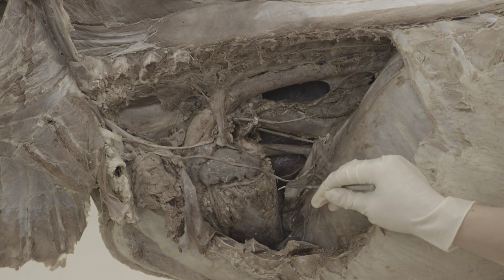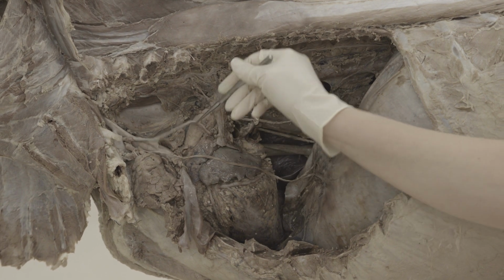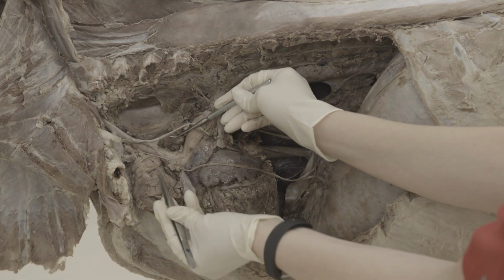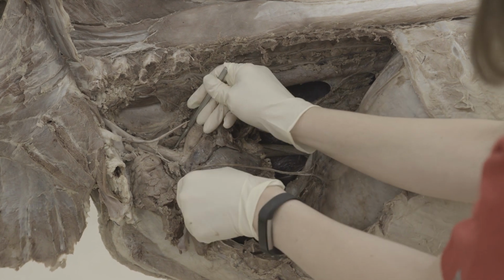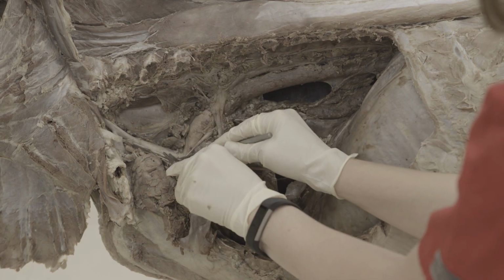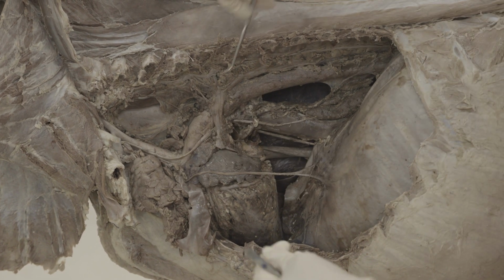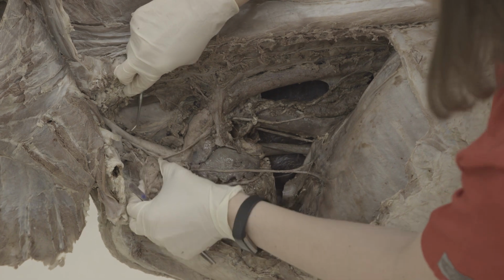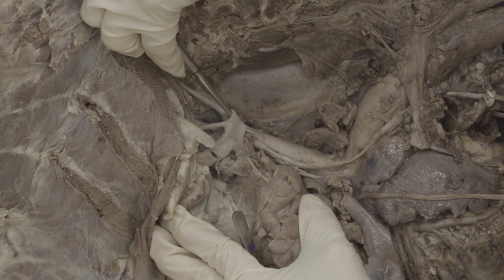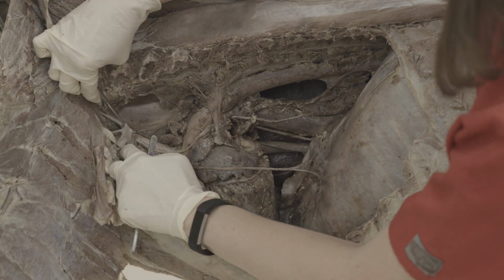All right, so then we'll go back to the aorta. And so we have the aortic arch here, and we have the brachiocephalic trunk coming off of that aortic arch. So again, you have to work through this thymus tissue. So thymic tissue is kind of everywhere in the calf. But here we have the brachiocephalic trunk, and that will continue cranially and give off a left subclavian artery and a right subclavian artery. So here you can see a left subclavian artery coming off of that brachiocephalic trunk. And then off of your left subclavian artery, we have some branches to name.